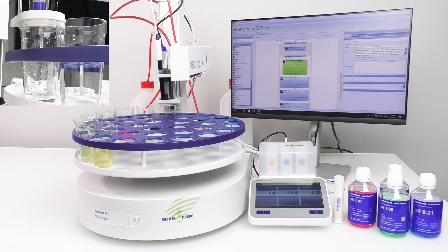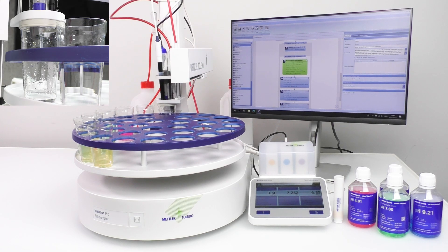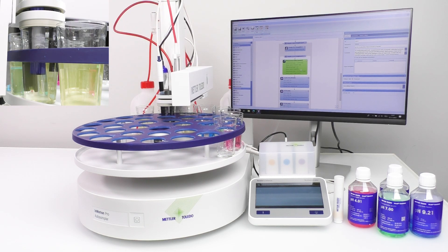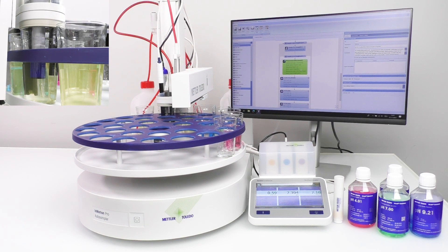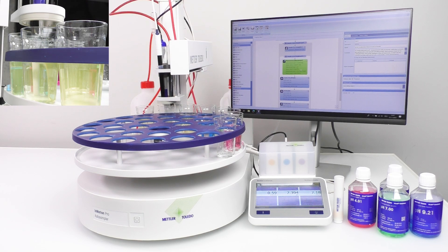Not to mention, the PowerShower automatic wash feature rinses the sensors and ensures that they are thoroughly cleaned before they are used for the next sample. You can achieve accurate results in a third of the time that it would take to analyze each parameter separately.